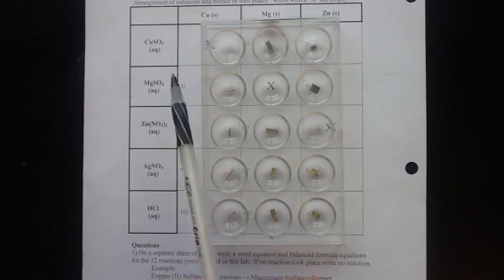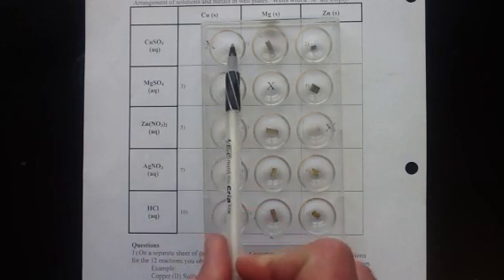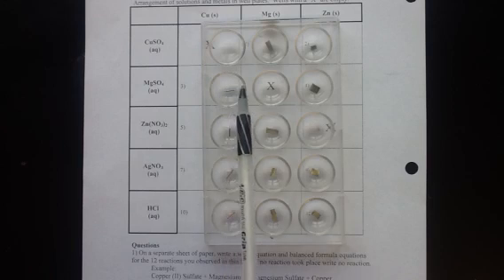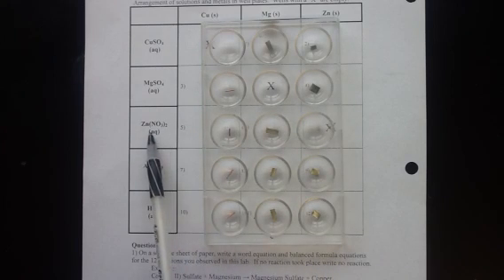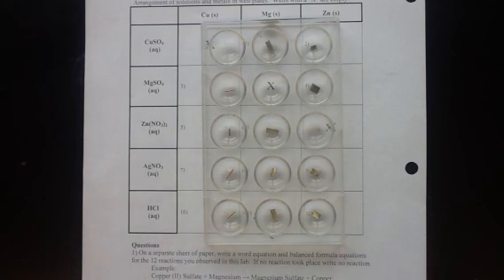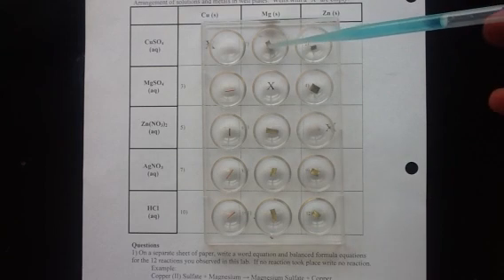Going across in the rows we're going to be putting in different solutions. The first one will be copper sulfate going into both of these wells, magnesium sulfate going into this row, zinc nitrate in this row, silver nitrate in this row, and hydrochloric acid in the bottom row. We're going to be seeing 12 different single replacement reactions, and by looking at which reactions take place and which ones do not, we'll be able to determine an activity series for these five metals.